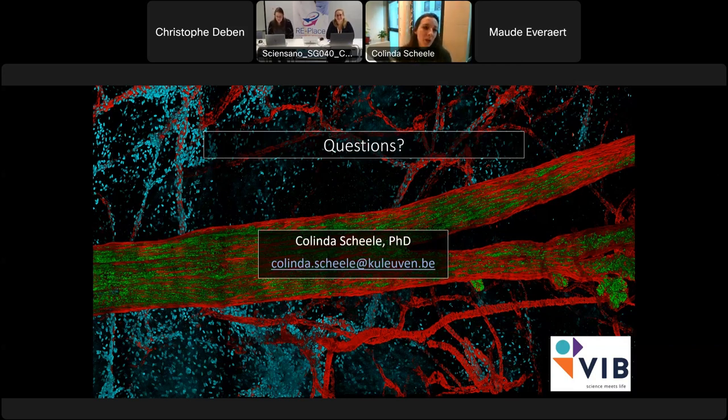Yeah. I think it's very, very early days. So what we are doing is we are also isolating the adipocytes from the healthy tissue donors. And we try to embed these cells then in the matrix, together with the epithelial cells. And we see that these adipocytes actually survive. They stay adipocytes in most of the cases. Some of them that are not well trapped in the matrix, because they float, they just float in the medium like a balloon, you know.